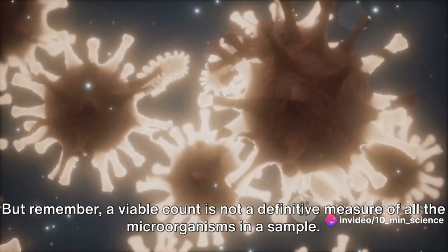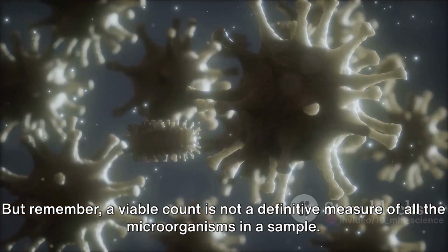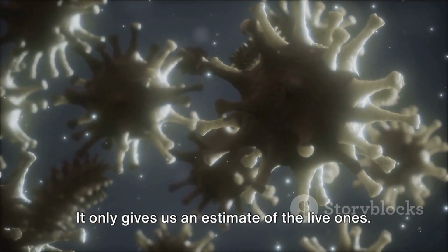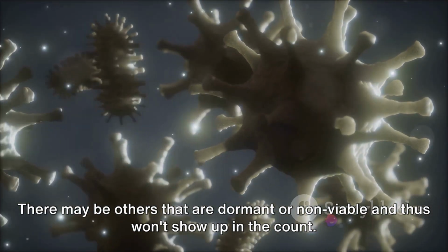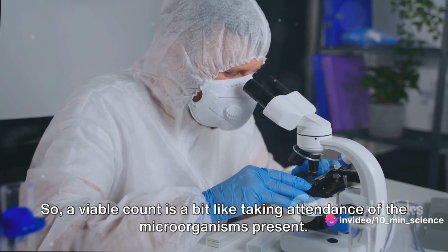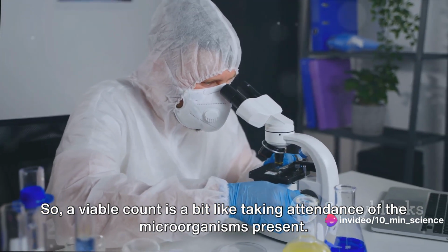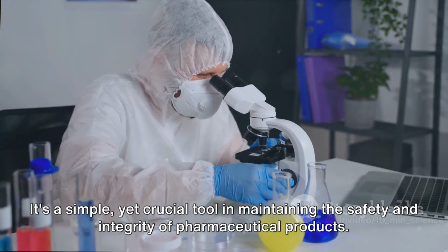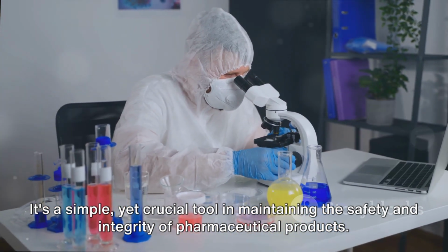But remember, a viable count is not a definitive measure of all the microorganisms in a sample. It only gives us an estimate of the live ones. There may be others that are dormant or non-viable and thus won't show up in the count. So, a viable count is a bit like taking attendance of the microorganisms present. It's a simple yet crucial tool in maintaining the safety and integrity of pharmaceutical products.